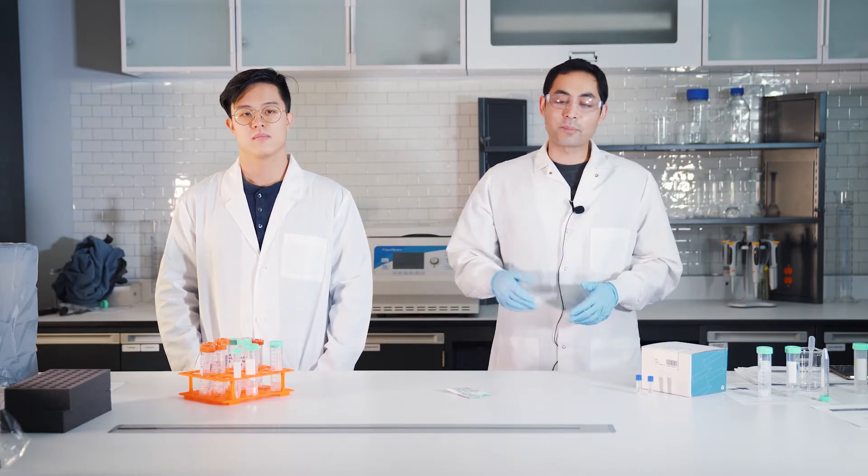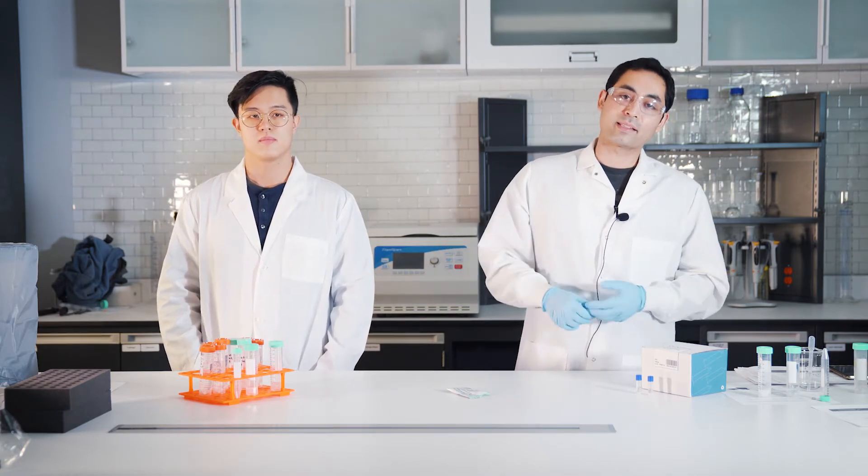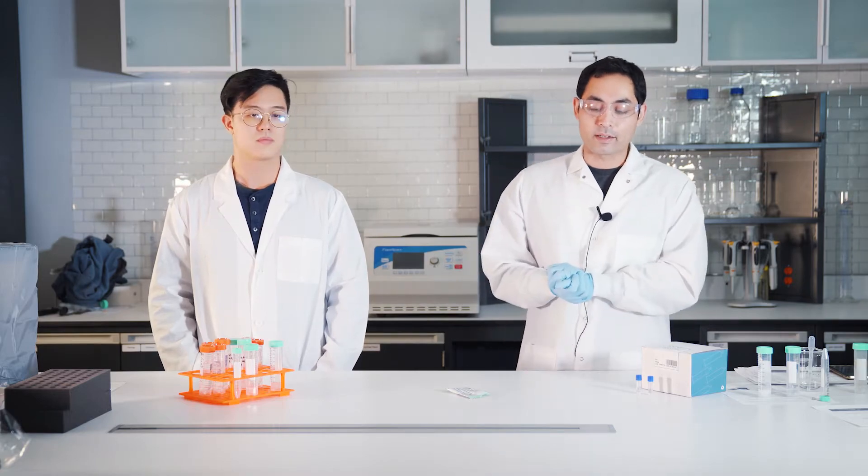For cleaning up your samples for mainly pesticide analysis, there's a couple of different products out there, so let's go over them.